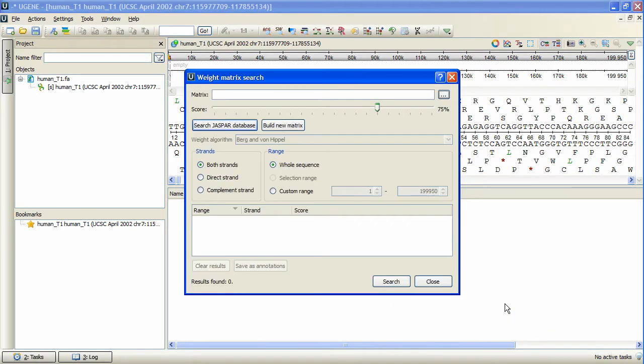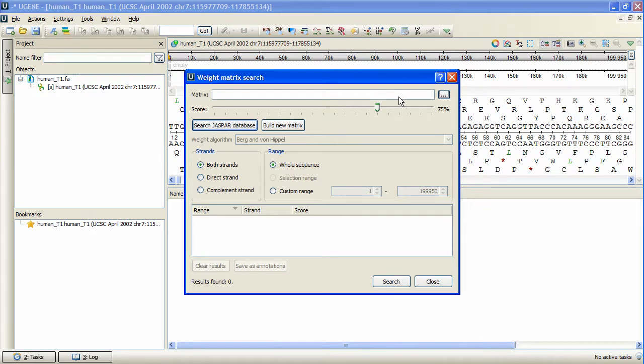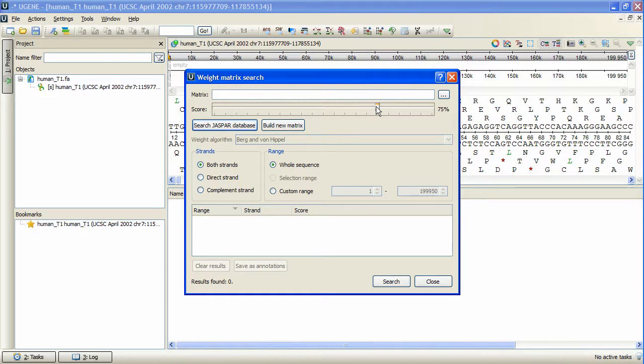In the open dialog box, we specify the matrix describing the transcription factor to search for in the selected sequence. Specify the search identity score and the standard search parameters, such as region and strand.